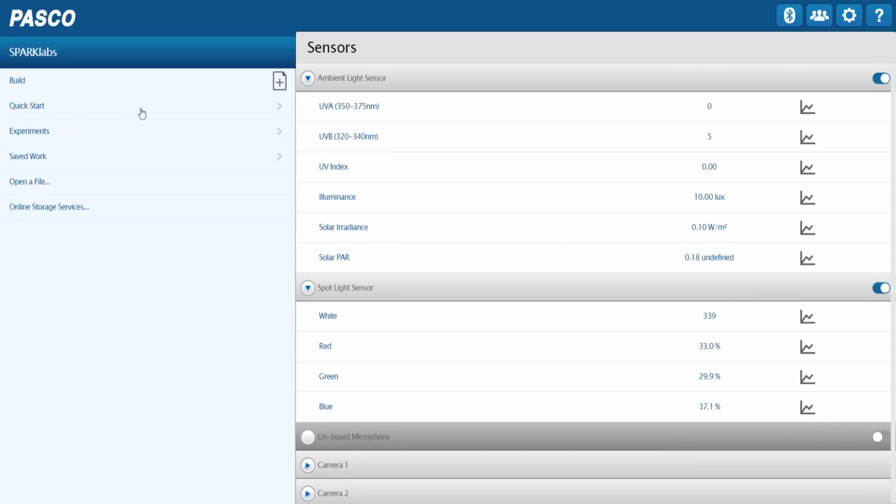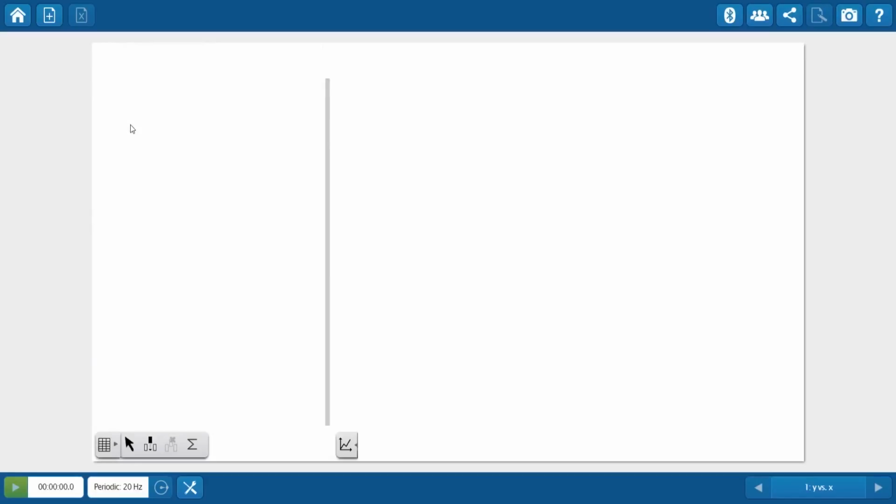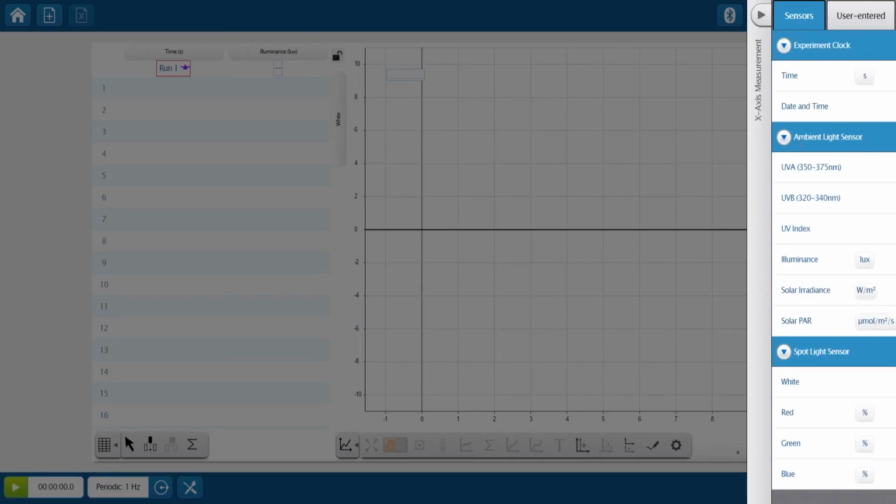The first change is the elimination of the home screen and the introduction of a chooser screen at launch. Live readings are now moved to the respective pages inside the Spark Lab. The changes help users check the initial start of the data prior to collecting data.